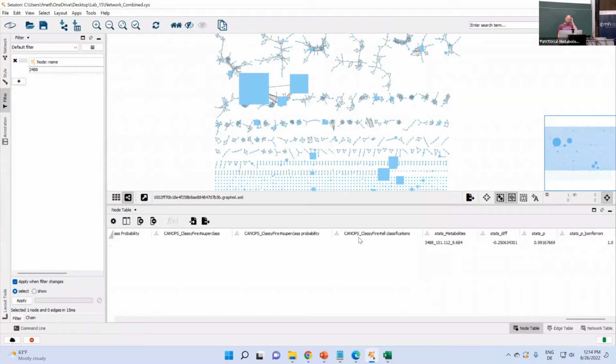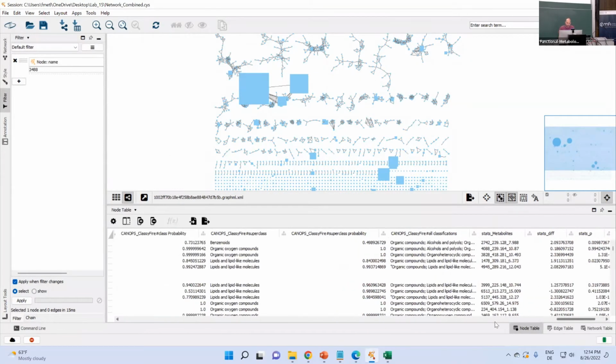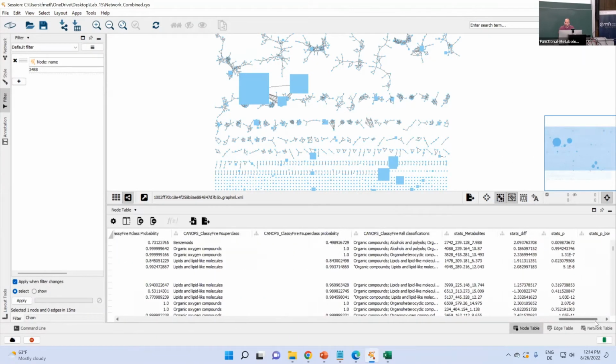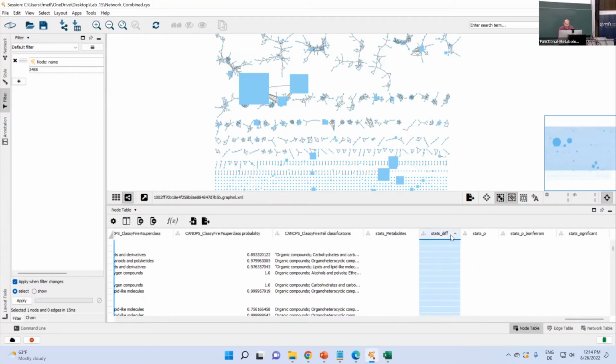And now, with the style, I could highlight features based on whether they were significant. I can also sort and go down from the strongest changes, and explore my data that way in a more systematic fashion. Okay, if you want, you can do that while I'm doing it. And for this lab, let's actually sort this here.